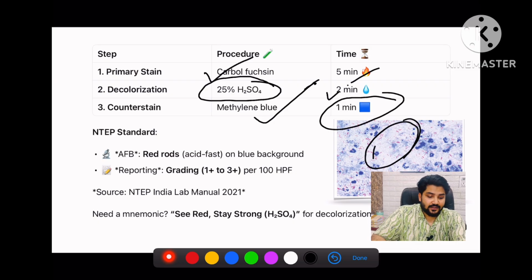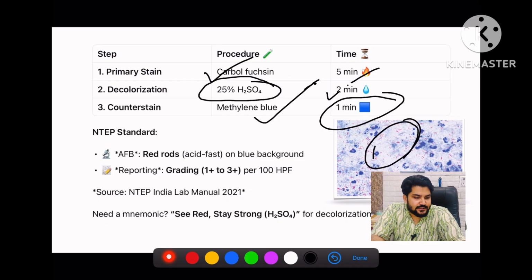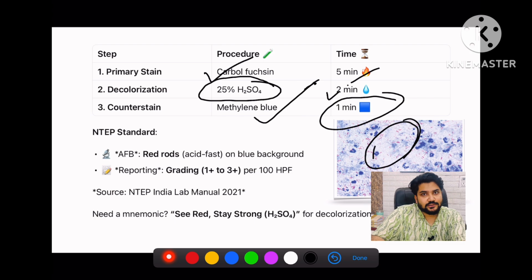Okay, fine. So on the basis of this microscopy, we grade the TB bacilli. हम grading करते हैं इसकी कि किस ग्रेड का है. ग्रेडिंग क्या बताता है आपको? तो फर्स्ट ऑफ ऑल इट विल टेल्स द डेप्थ ऑफ द डिजीज द पेशेंट इज हैविंग, व्हाट काइंड ऑफ डिजीज, इट्स द लीथल वन या द माइनर वन. सो दिस ग्रेडिंग विल टेल यू दैट. एंड द सेकंड इंपॉर्टेंट थिंग इज कि आफ्टर ट्रीटमेंट, you will see the grading, whether this grade is going up or going down.